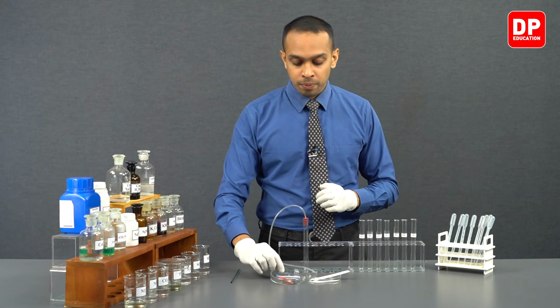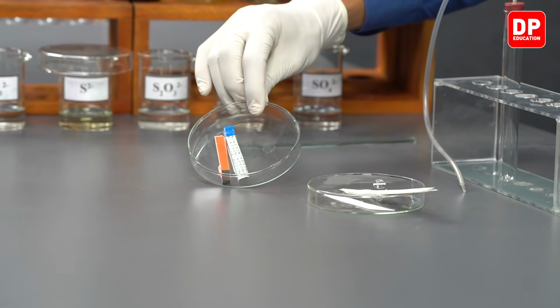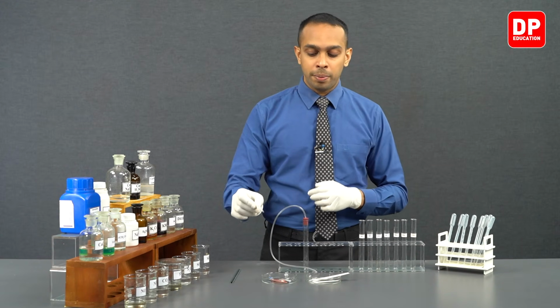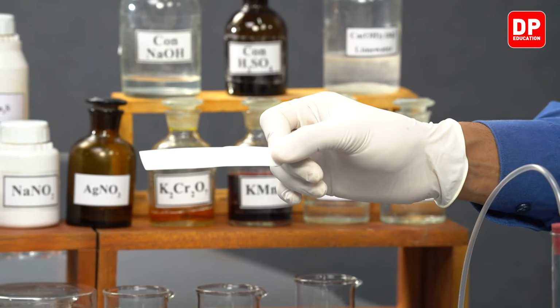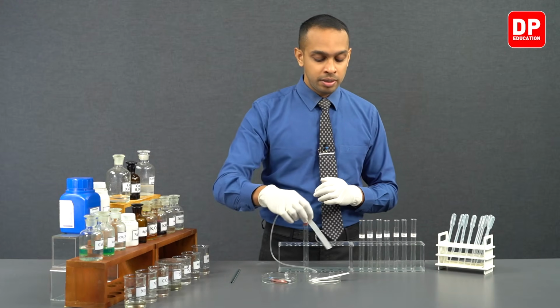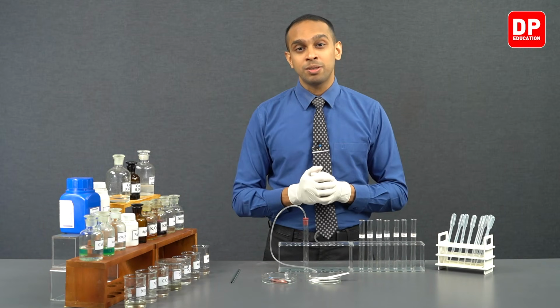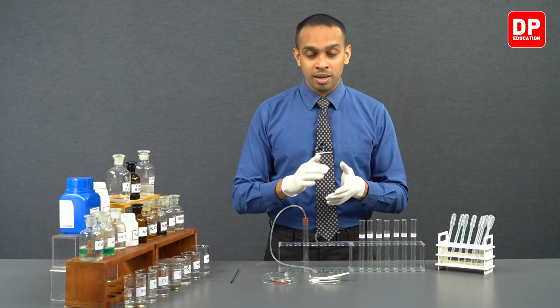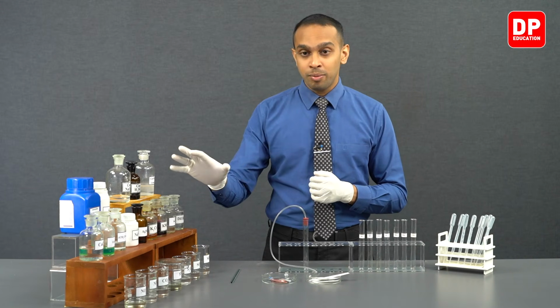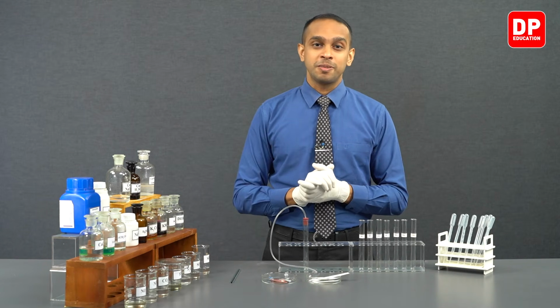We'll be using blue and red litmus paper. And we have filter paper cut into small strips here. In this experiment, we'll be using filter paper dipped in different solutions. So these are the chemicals and the equipment we will be using for this experiment.